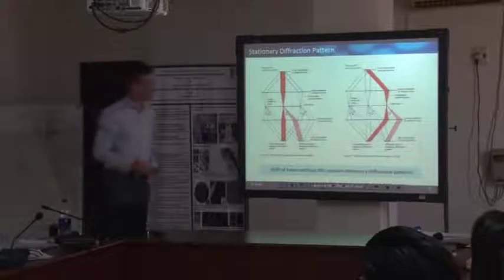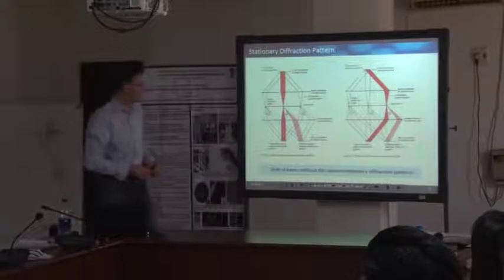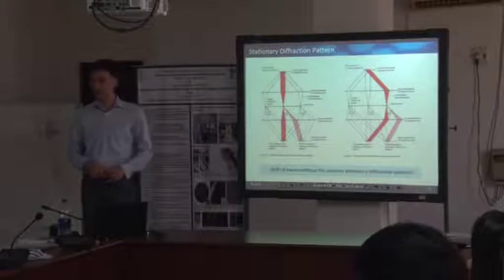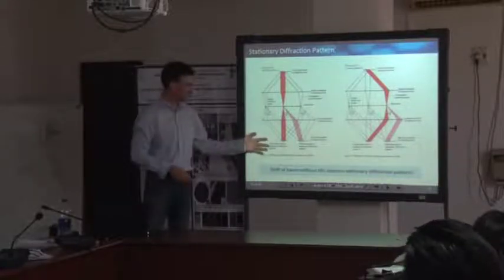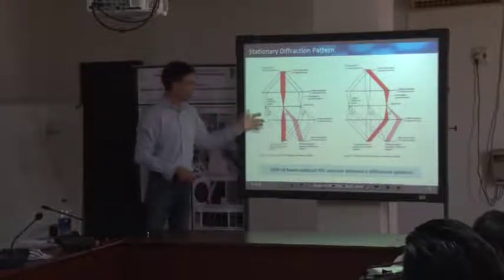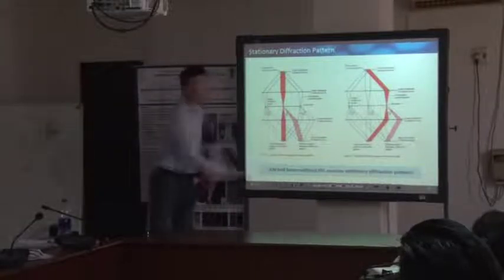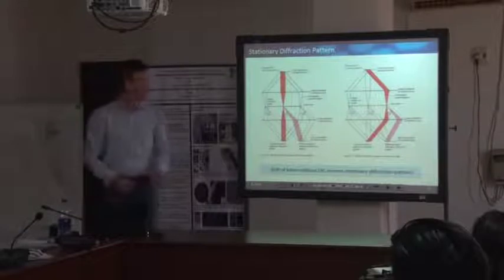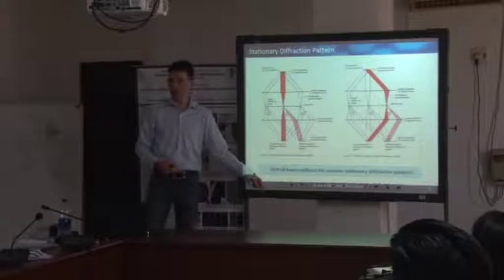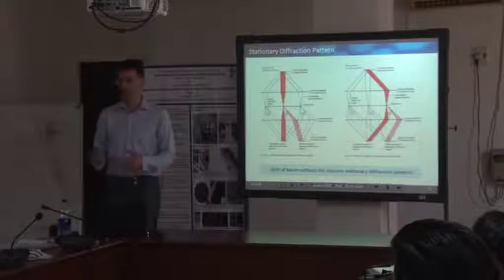In older microscopes, this beam was not descanned, we have this scanning, and for modern microscopes, we even have a de-scanning system. So we have a second set of scan coils below our objective lens to put our diffraction pattern back onto the optical axis. This is in principle needed if you want to do spectroscopy, because with spectroscopy you want to collect that signal using the spectrometer, and we are going to deal with that tomorrow.